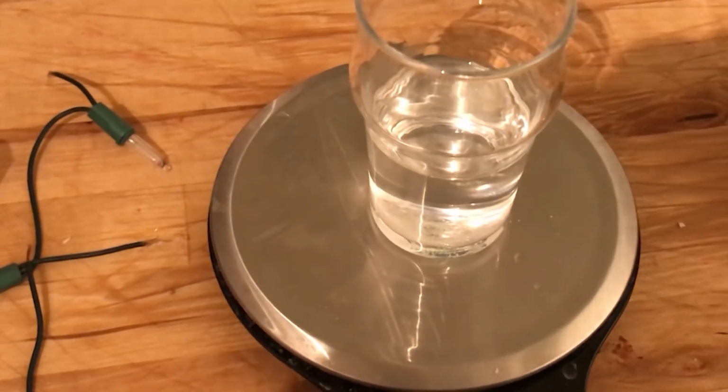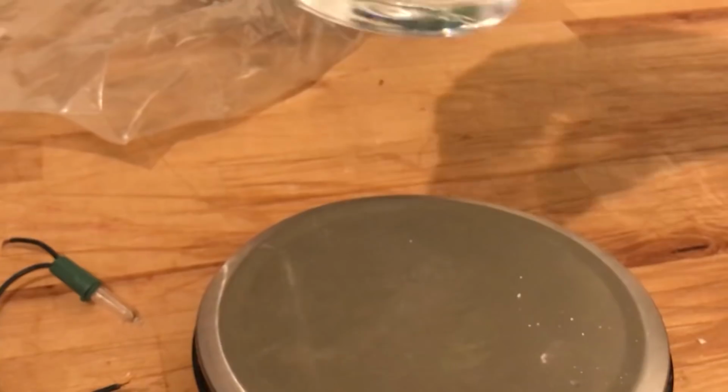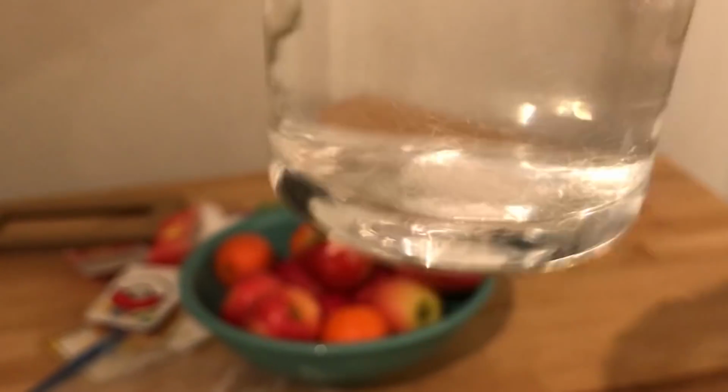Perfect. Okay, leave it at that. So I need to swirl this up. It's going into solution. Continue, swirl, swirl, swirl. The solid at the bottom is getting kicked up, going into solution. Keep going. It's pretty easy to see that this is soluble.